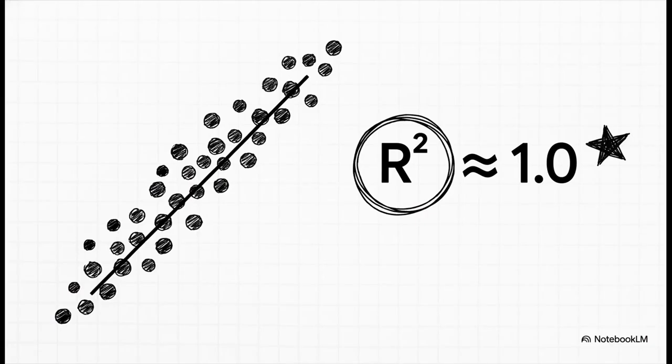Now, when you tell Origin to do a linear fit on that curve, it automatically gives you the R-squared value. Just think of it as a score for your data, from 0 to 1. And what you want to see is a number really, really close to 1.0. That's a beautiful thing. It means your data is solid and you've reliably demonstrated the principle you were testing.